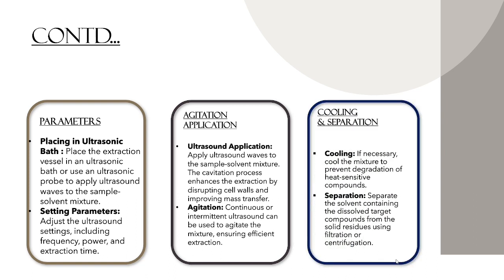The final and last step is cooling and separation. If necessary, cool the mixture to prevent degradation of heat-sensitive compounds. Separate the solvent containing the dissolved target compounds from the solid residue using filtration or centrifugation.